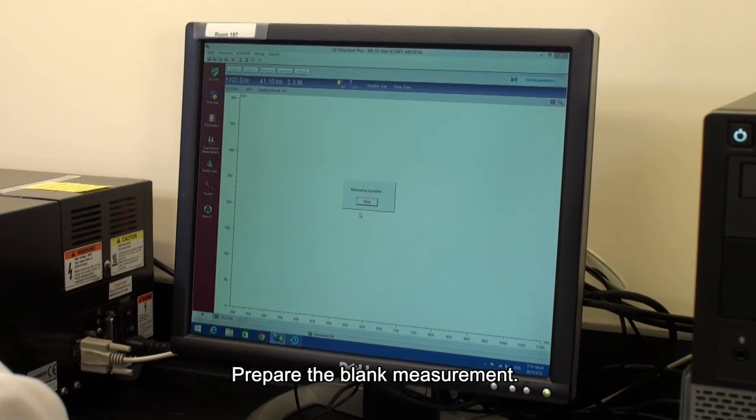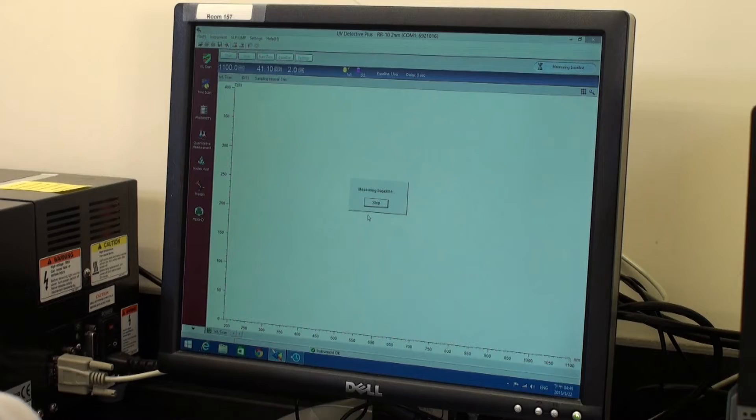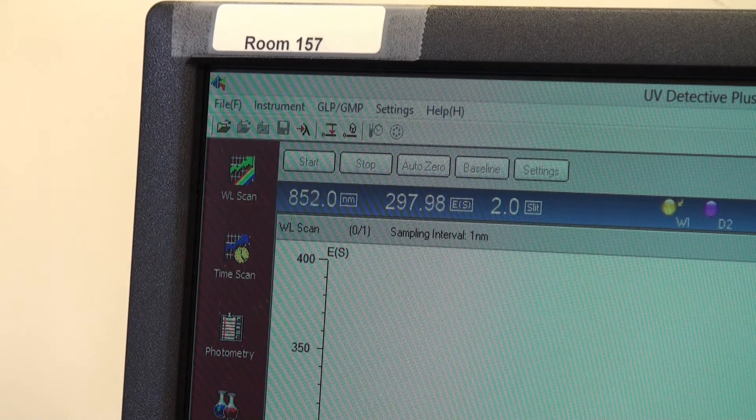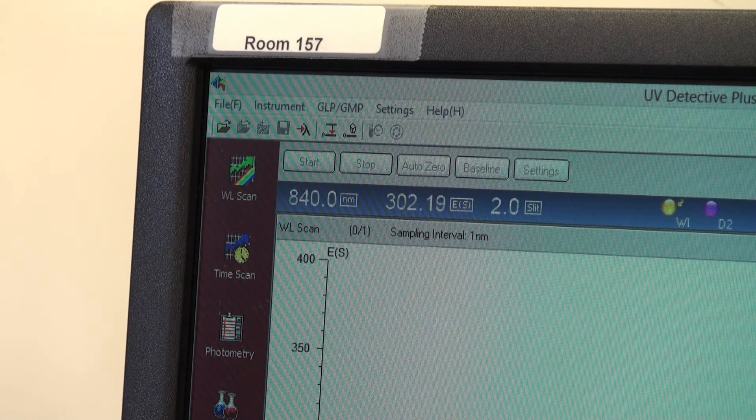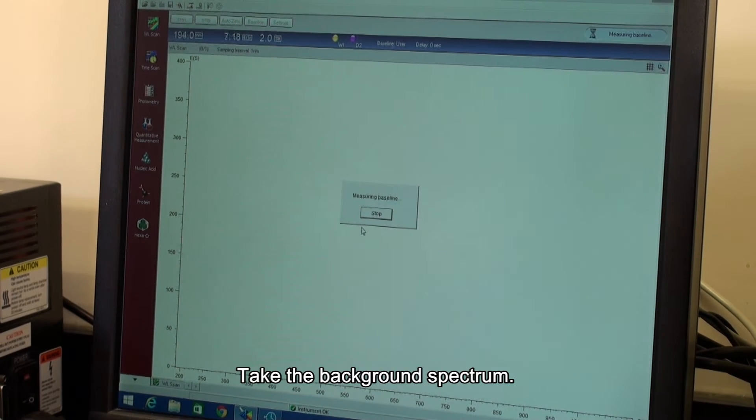Prepare the blank measurement. Start the scanning. Take the background spectrum.